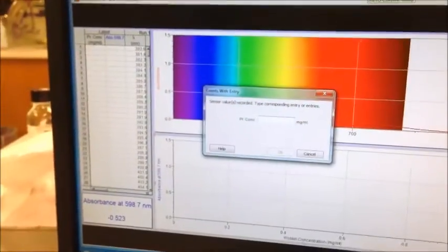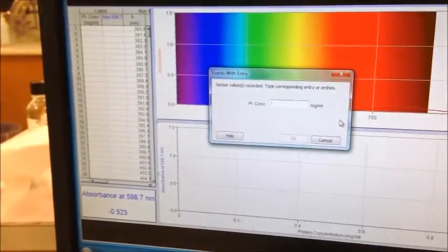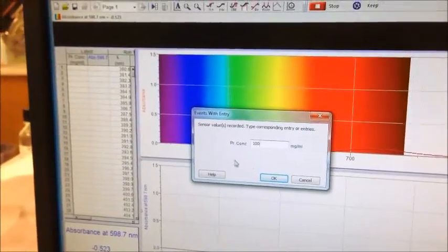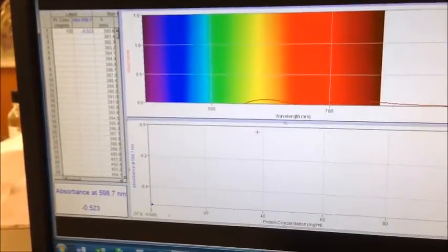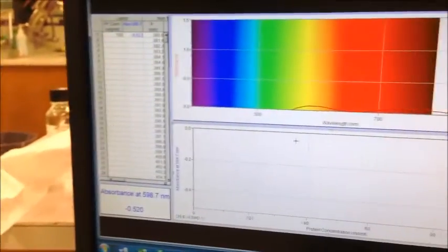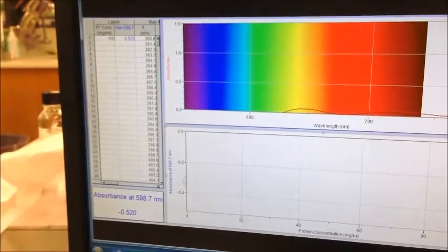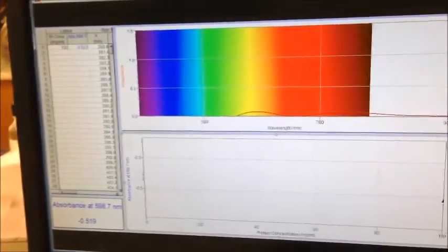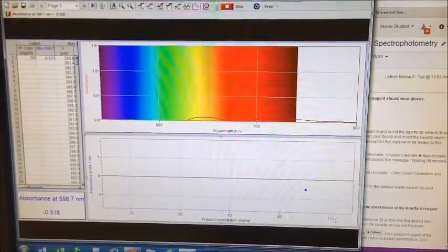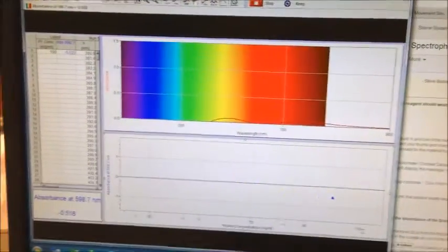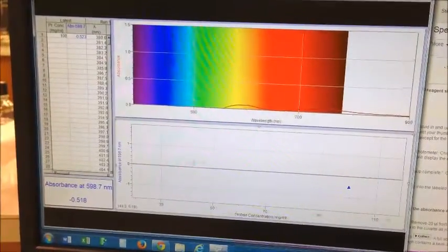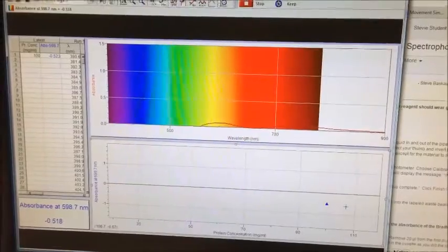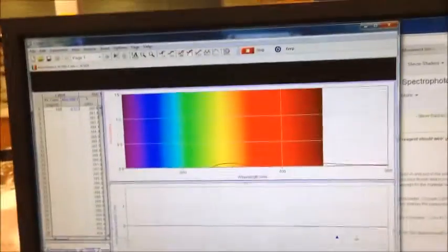Where's my point? Where's my point? What? My point is at negative .5, how could I have negative .5? Alright, I mean, I put in blue stuff, right? Can't be negative.